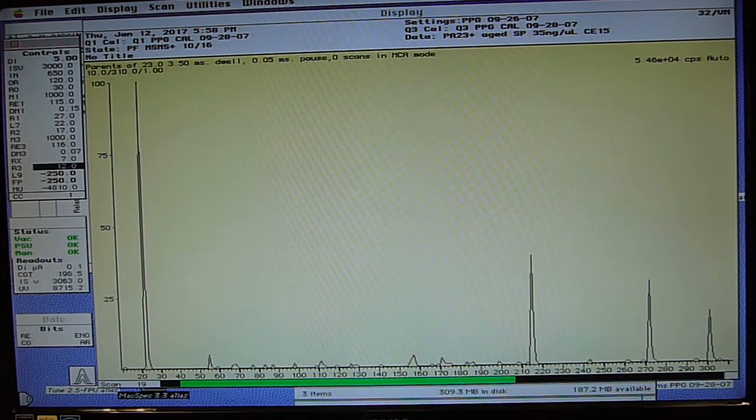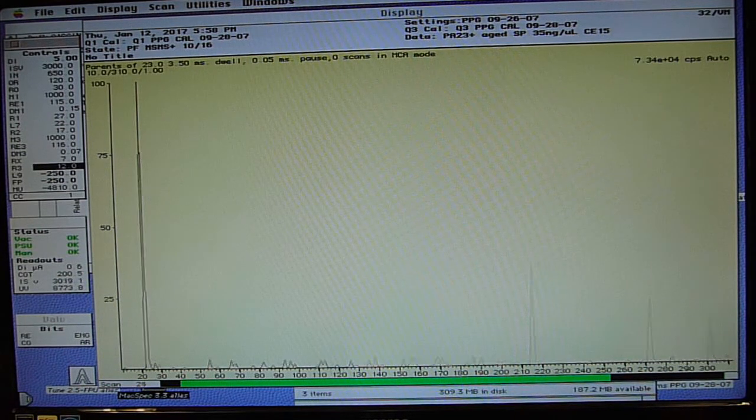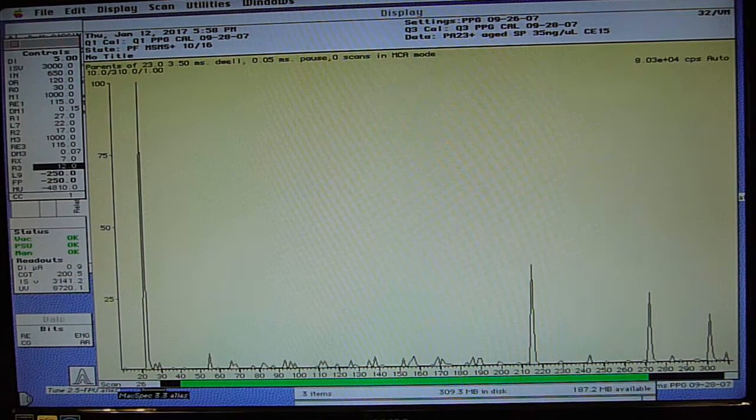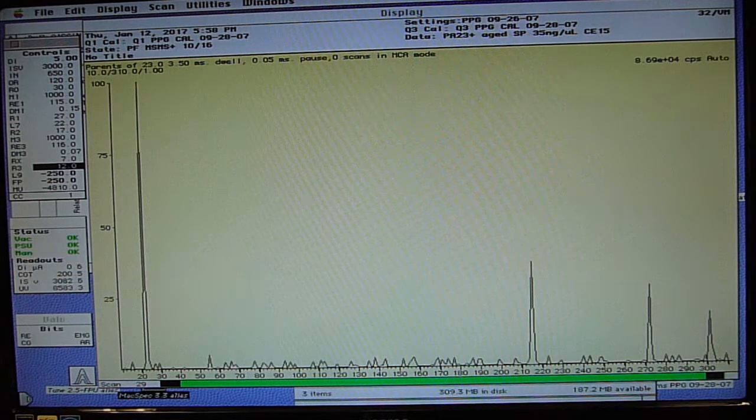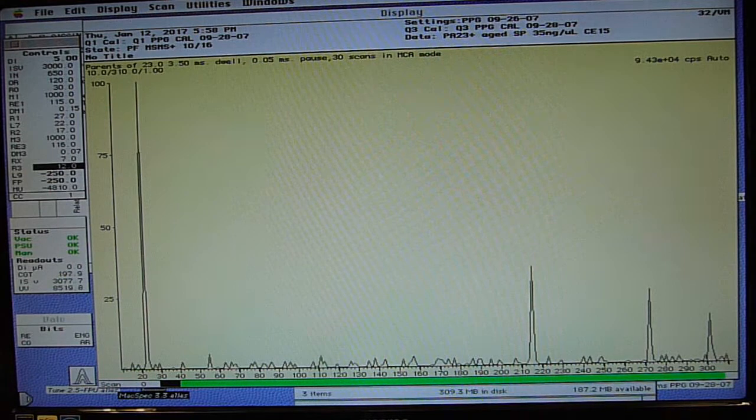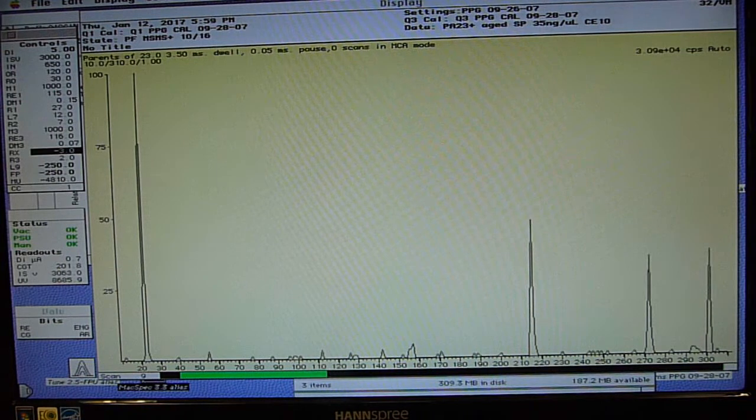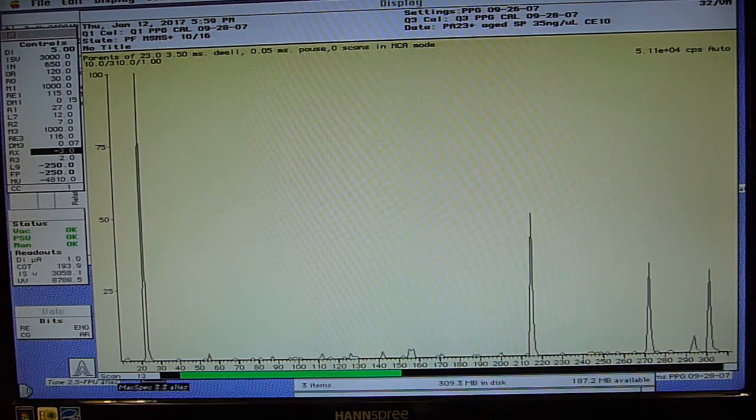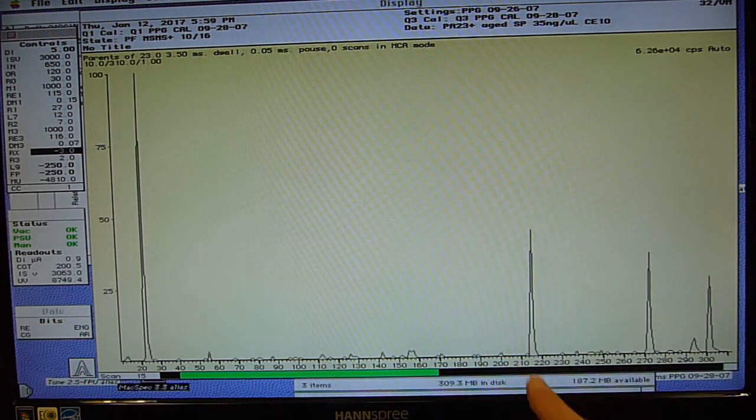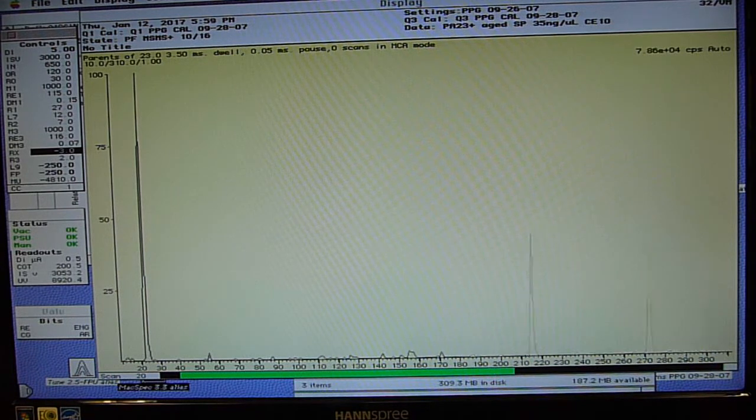We'll try one more at 20 eV. So it's going to close now. So let me save the data. 20 eV is more energetic. But we should see, hopefully, the same ions. 23, 215, 272, 308. We've got some of 294. But that's sort of borderline.